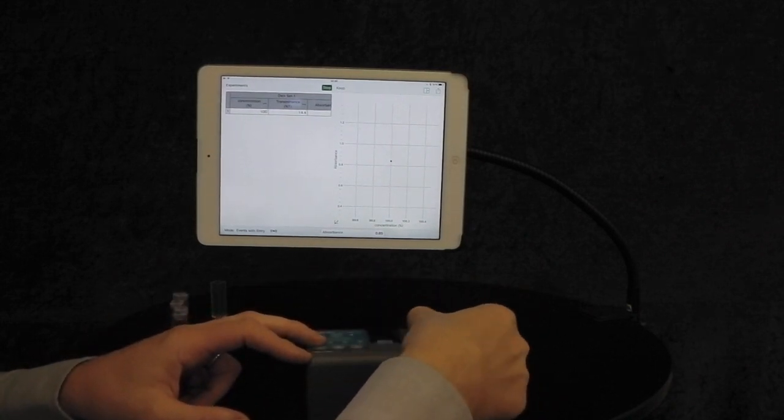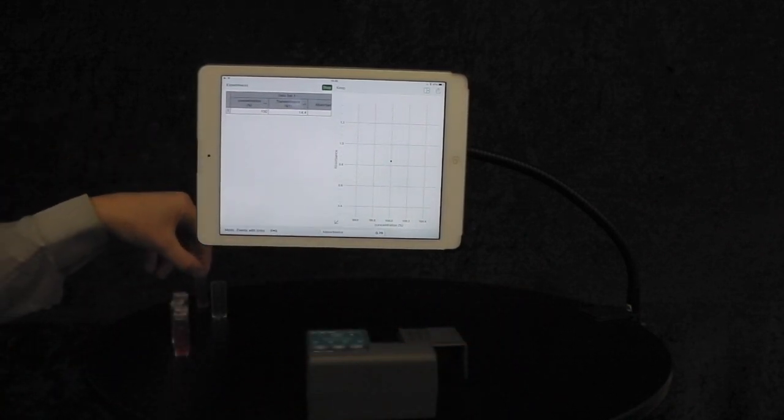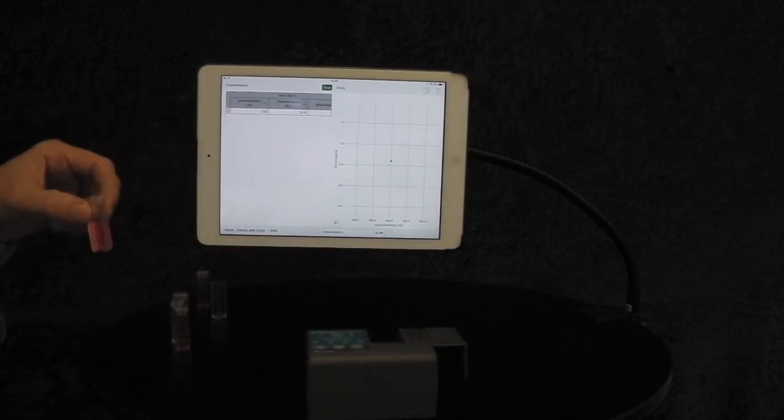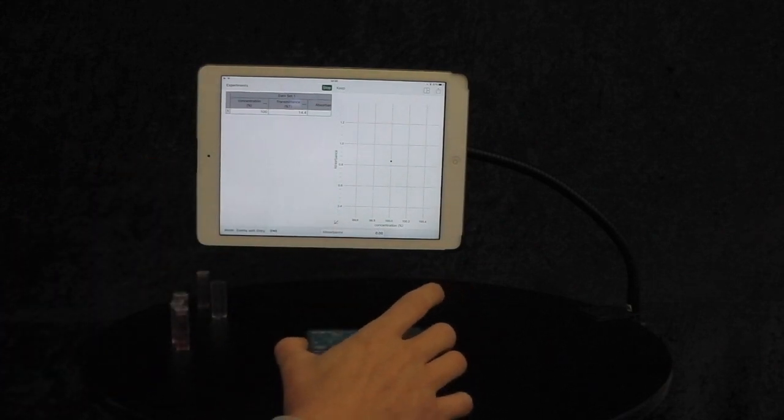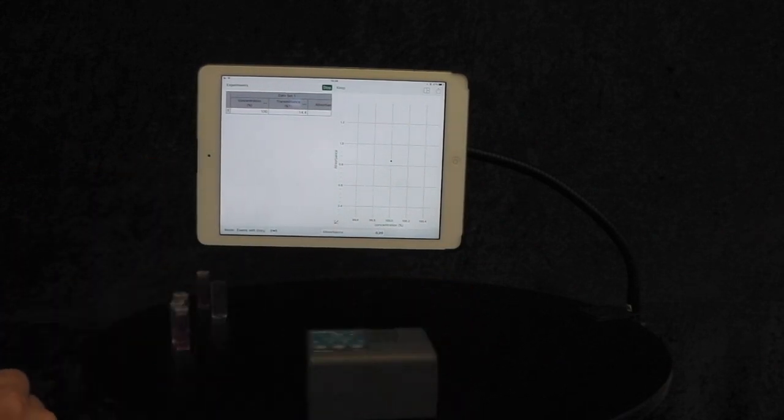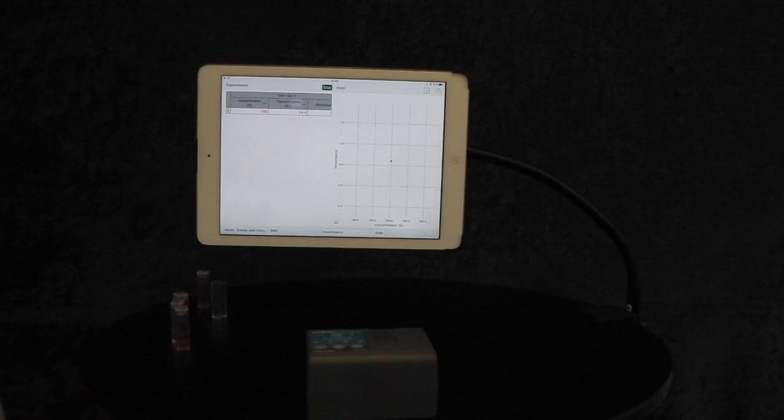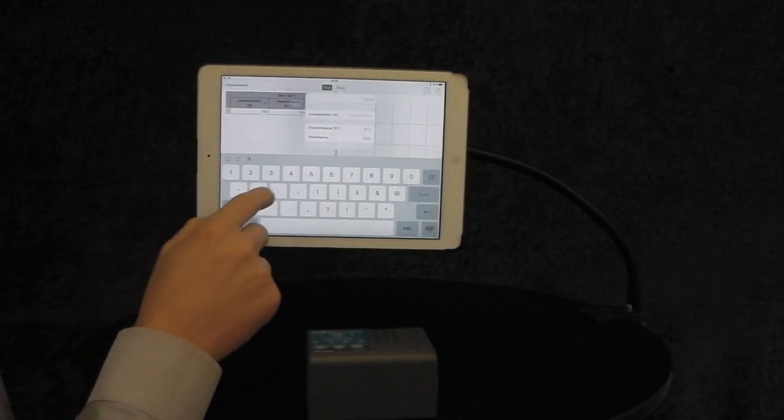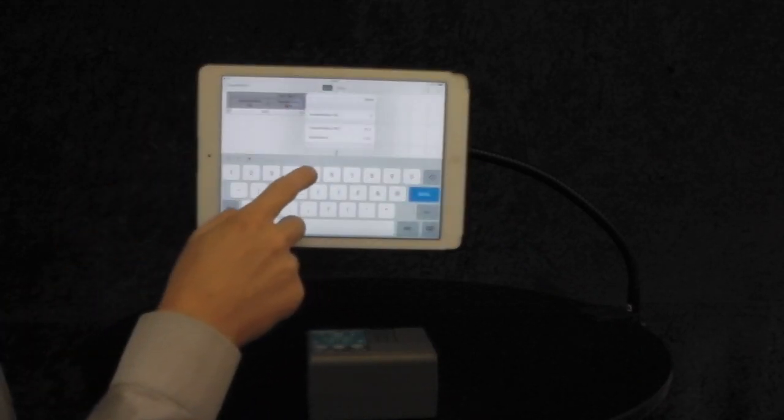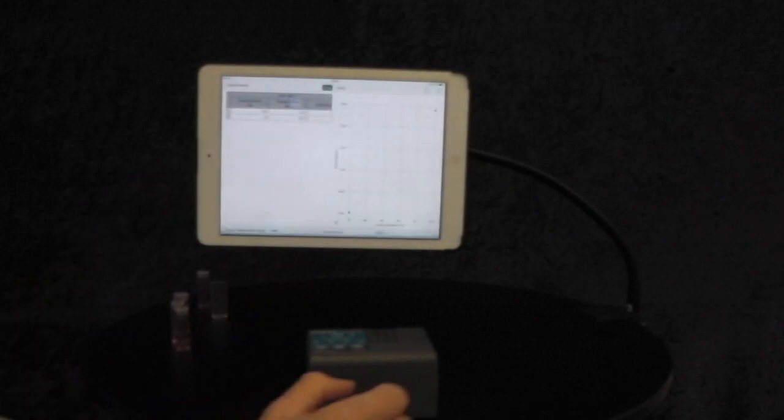Take that cuvette out. Get the next one. In this case, it's 75%. Close the lid. Wait for the reading to stabilize. Press Keep. Type in 75%. Done.